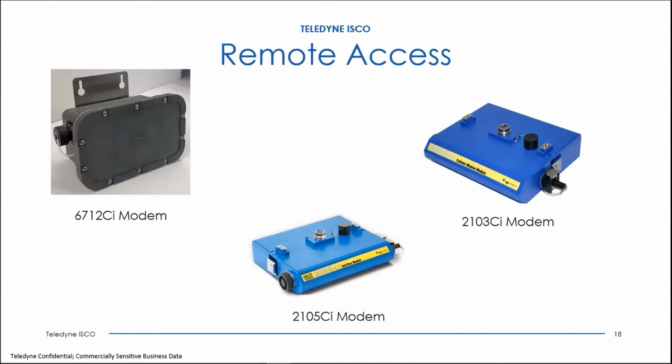They'll send out text messages when the program starts. You can even send it a text message that will start the program up. So modems are very common nowadays. It's basically a cellular modem, just like your cell phone. You have to have a cell plan with it, and then you can communicate with it remotely. Pretty nice accessory to have.